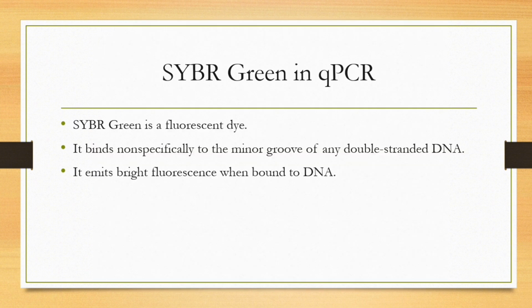SYBR Green in real-time PCR. SYBR Green is a fluorescent dye. It binds non-specifically to the minor groove of any double-stranded DNA. It emits bright fluorescence when bound to DNA.